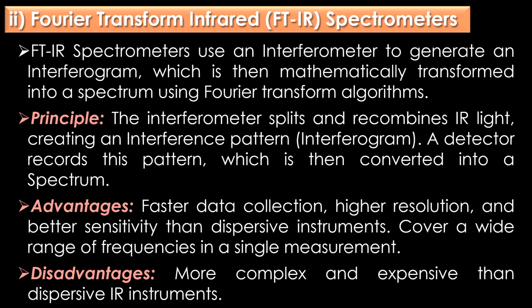algorithms. Working principle: instead of scanning individual wavelengths, the interferometer splits and recombines IR light, creating an interference pattern called an interferogram. A detector records this pattern, which is then converted into a spectrum.